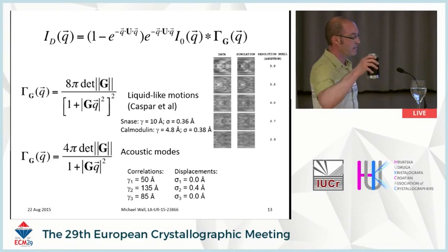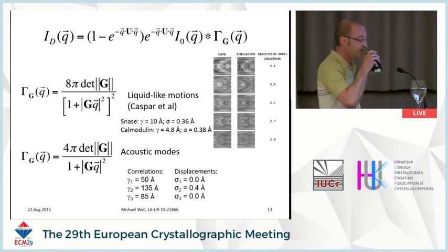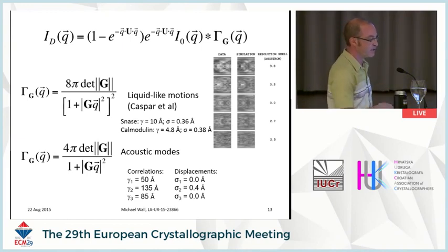Okay, so this shows some of the modeling that we've done. At that time, the models we were using were phenomenological models described essentially by this equation at the top. This equation has two key components. One is something like a Debye-Waller factor. You have a U matrix just like a U matrix in crystallography, applied uniformly to all atoms. And you see one minus that Debye-Waller factor, because what goes into the diffuse scattering is what is lost by the Bragg.